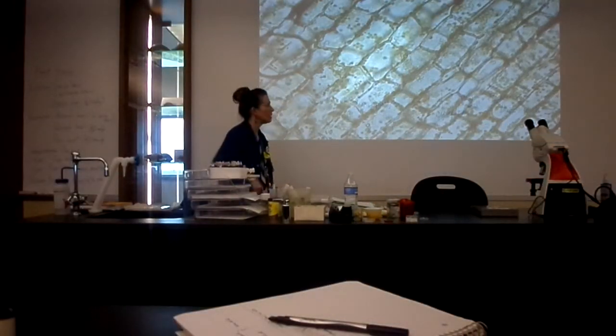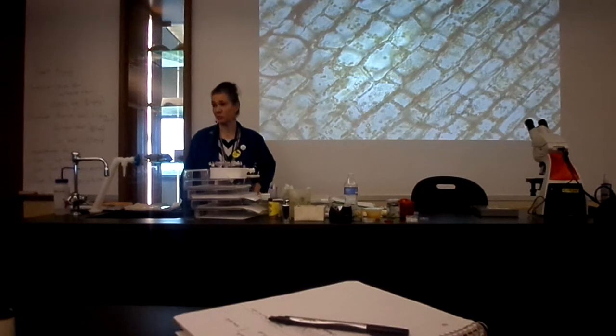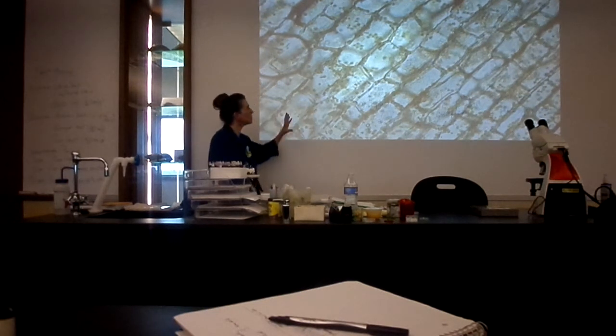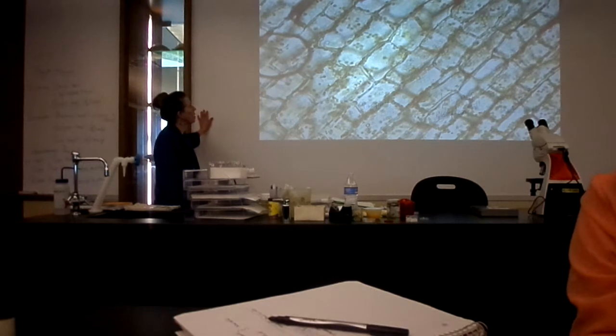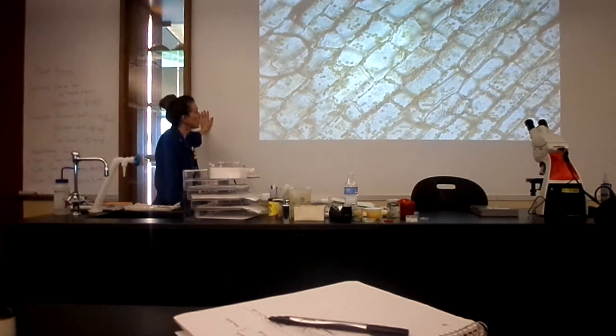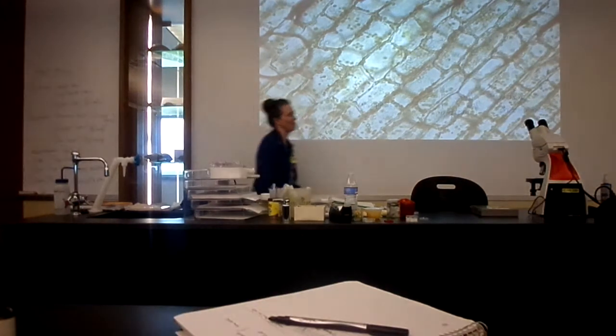So, epidermal tissue, cytoplasmic streaming. The name of the plant is called Elodea. You won't need to know where it came from, but it's just a common green aquatic plant. Will it be on the test? Sometimes it does, sometimes it doesn't. That's pretty cool.